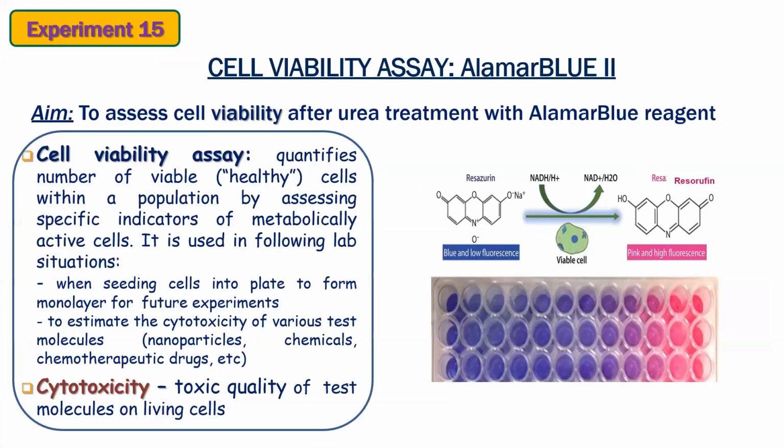We have the same reagent, in this case, Alamar blue. If it is oxidized, it is blue and does not have much fluorescence. If it is reduced, then we have the change of color to pink, and we have the increase in fluorescence intensity. Okay, so in the previous lab, you were looking at the proliferation rates and how the proliferation affects the absorbance of these cells, or absorbance of the Alamar blue.